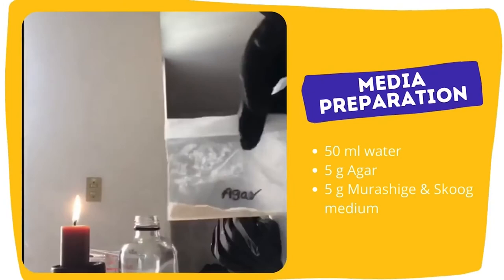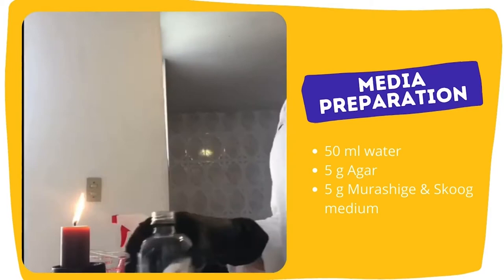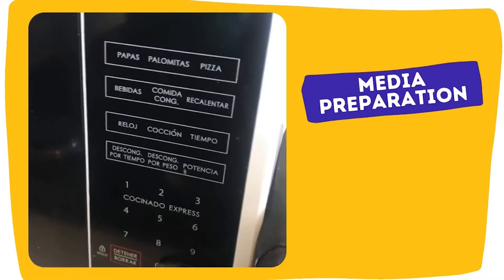For the media preparation, I use water, agar, and MS medium. Prepare the medium by adding the MS medium followed by the water, mix it, and add agar. Take it to the microwave for a short period of time to heat the solution until it reaches homogeneity. Be careful not to spill the solution. Pour the medium, cover it with aluminum, and sterilize.